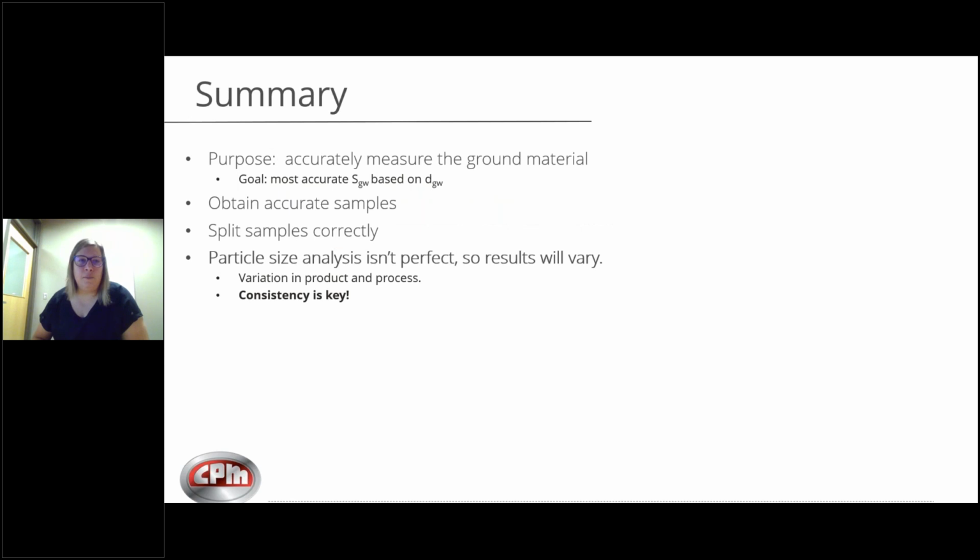So in summary, the purpose of particle size analysis is to accurately measure that ground material, and to do that we need to get the most accurate standard deviation based on a particle size. This starts with obtaining accurate samples and splitting and sampling them correctly.